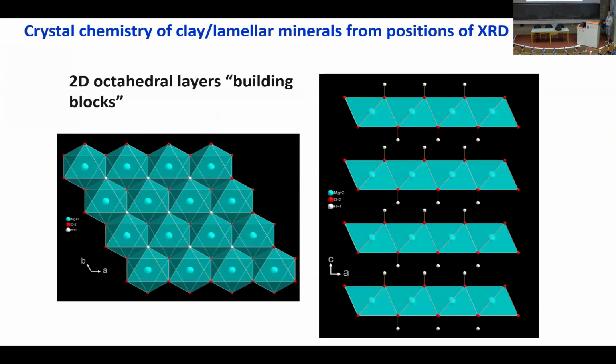Just to make that clear, I will also show you another type of structure I will use. I will use that for lamellar oxides, lamellar hydroxides, layered double hydroxides, and the basic structure is always the same for all these minerals. You just think about an octahedral sheet with no tetrahedral sheet on either side. In this case, this is just the brucite structure. You can recognize magnesium, OH2, just perfectly. So it's a trioctahedral character. There is no vacancy here.